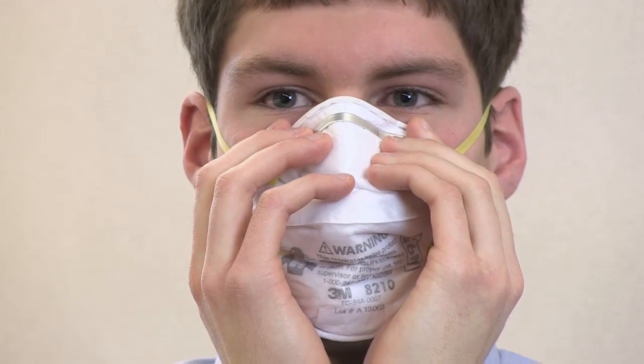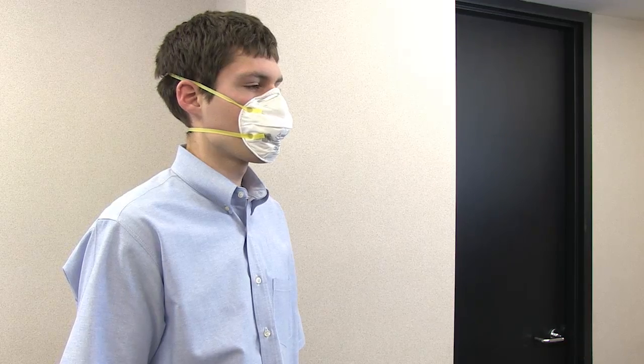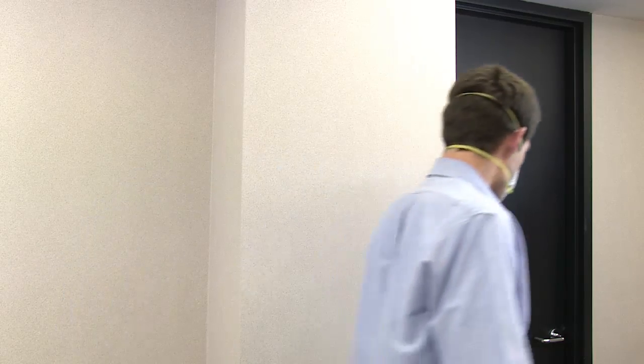First, place one or both hands gently on the outside of the respirator. Inhale and exhale forcefully, making sure no air leaks from the edges. If you do notice leakage, reposition the respirator on your face and readjust the nose piece. Repeat this test until your respirator fits properly without air leakage. Then you can enter the work area.